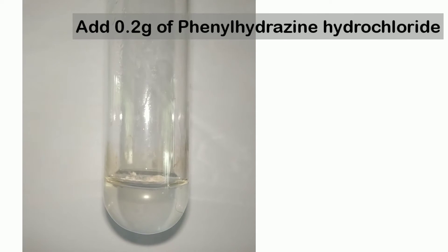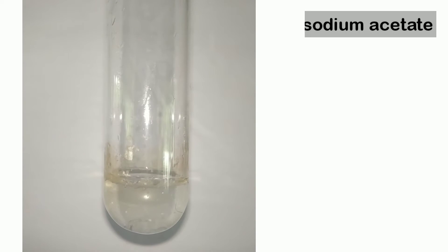Now we will be adding 0.2 grams of phenylhydrazine hydrochloride. Use gloves while handling phenylhydrazine. Now we add 0.1 grams of sodium acetate crystal.